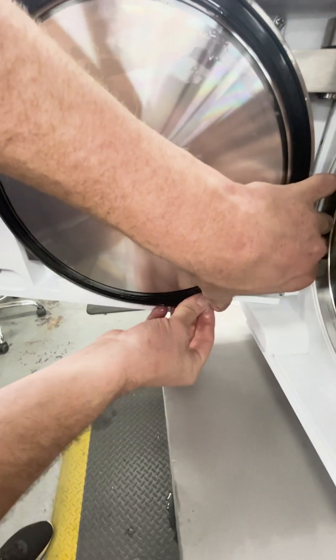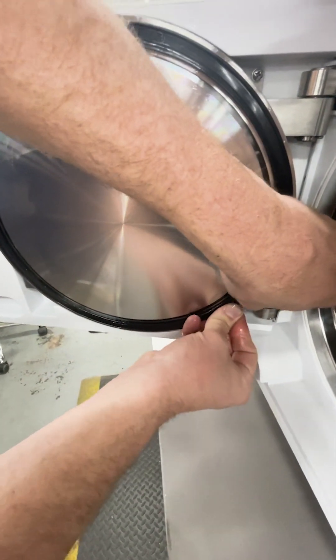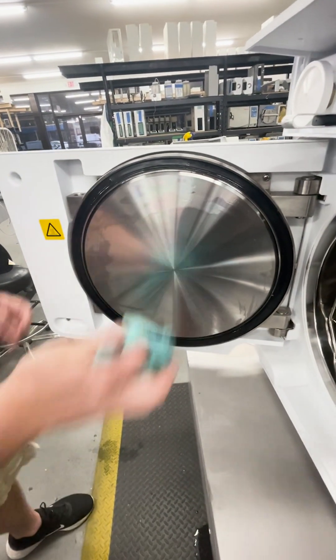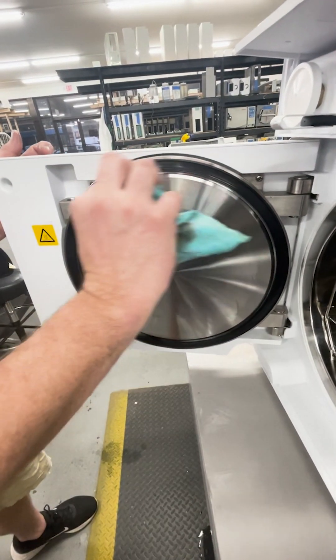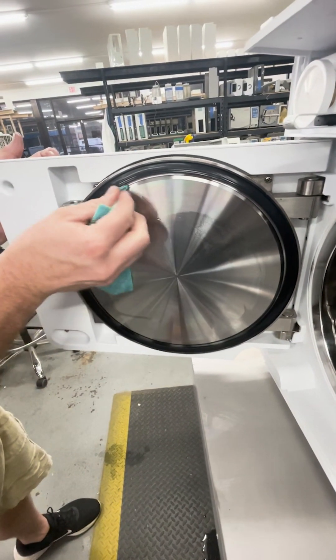Do the same to the bottom and just like that your seal is in. Once you're done, wipe down the entire seal. You will get some popping and cracking — that's the extra lubricant stuck behind the seal when it heats up. Get off everything you can, but it's not going to hurt anything.